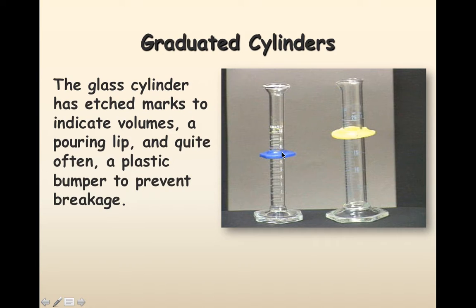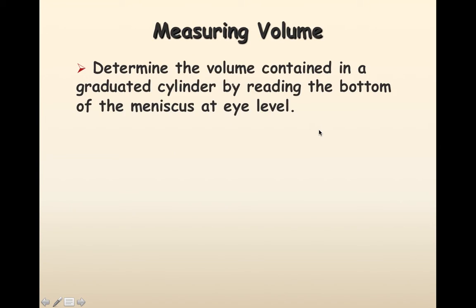You also want these plastic bumpers out of the way, which are designed to protect the graduated cylinder if it tips over. You don't want them interfering with your measurement as well.